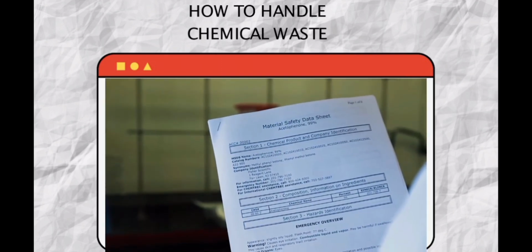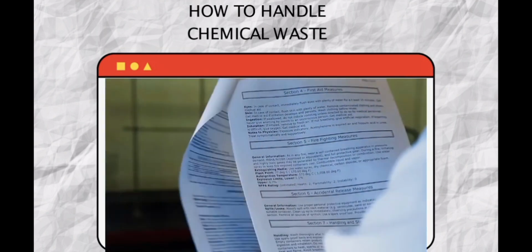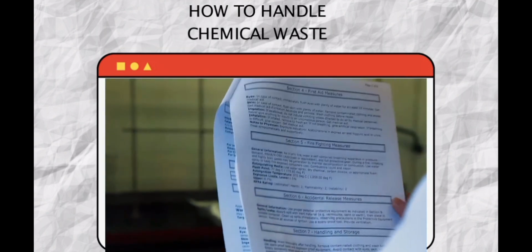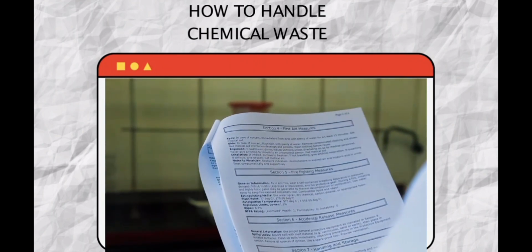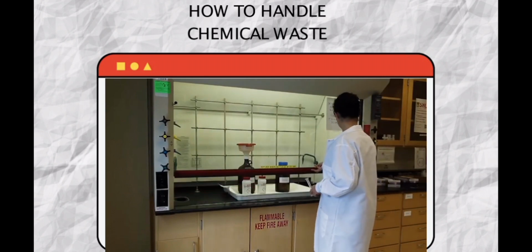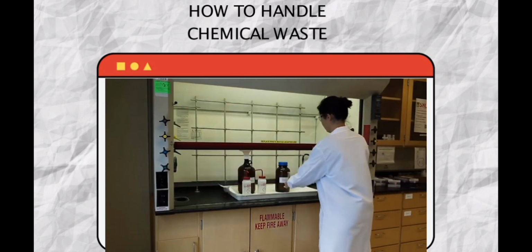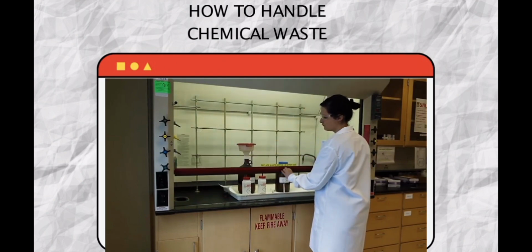Organic chemistry experiments involve chemicals that must be handled with care. As evident by the material safety data sheets, the chemicals we use can be hazardous. Just as it's important to use caution handling the chemicals during the experiment, we must properly dispose of chemicals after finishing the experiment.